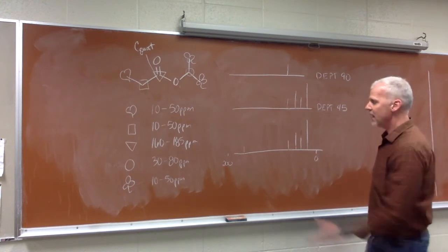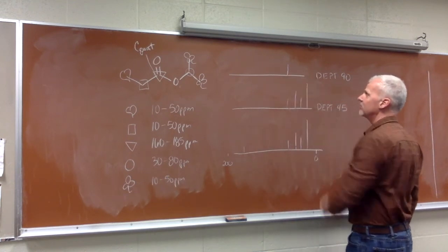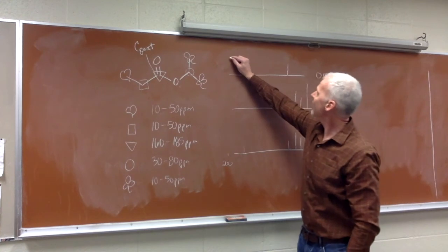Okay. So now we have evidence for our C-quat, our carbonyl, and our CH from comparing those different experiments. The last one.